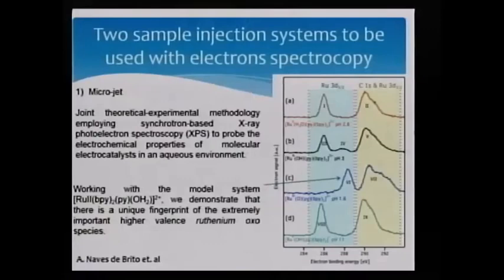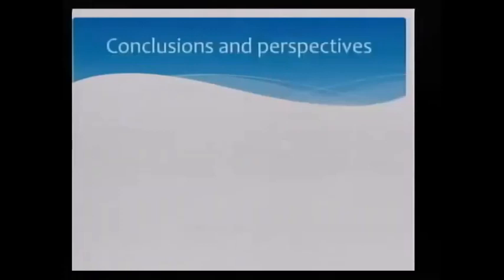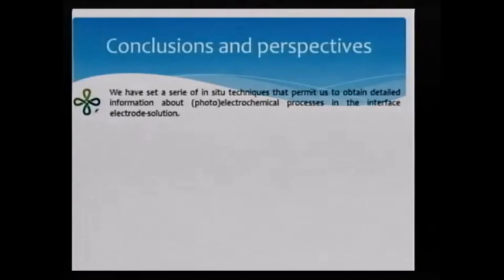So, of course, in this system, but also in almost all the systems that we study in the CINE, the presence of water and electrolyte in general is really, really important. So all these characterization techniques that are performed in the presence of the electrolyte could bring us very valuable information. Well, some conclusions and perspectives. We have set up a series of in-situ techniques that permit us to obtain detailed information about photoelectrochemical processes at the electrode-solution interface. Hopefully, it will be very, very important for your simulations.